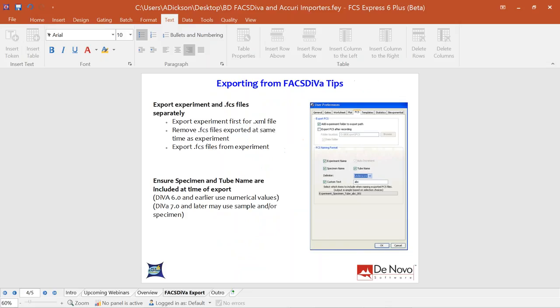For the first part — exporting from FACS DIVA — there are two key tips. First, ensure you export your experiment XML file separately from your FCS files. When you export your experiment, the FCS files may only be valid within DIVA software. So export the experiment XML first, delete those associated FCS files, then do a second export to get the valid FCS files from DIVA.